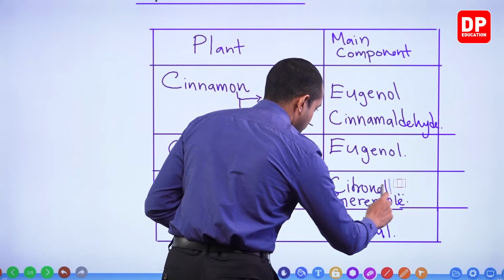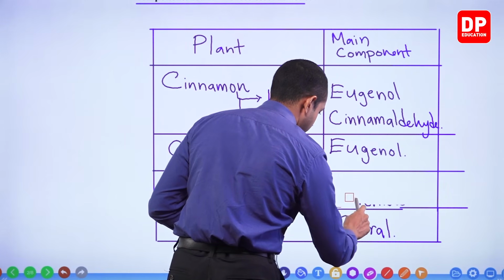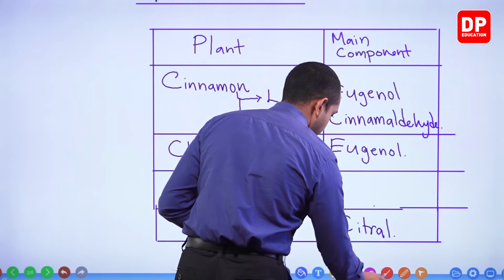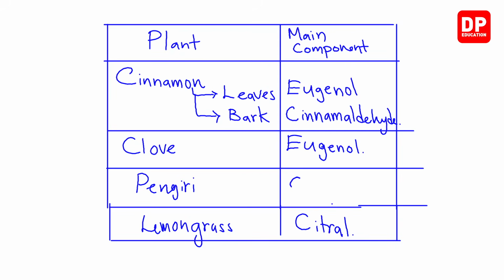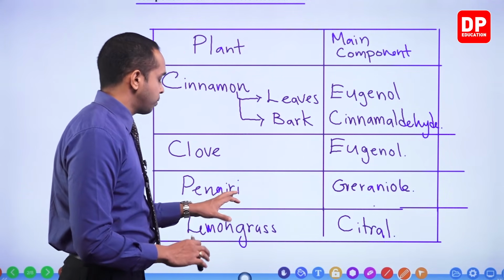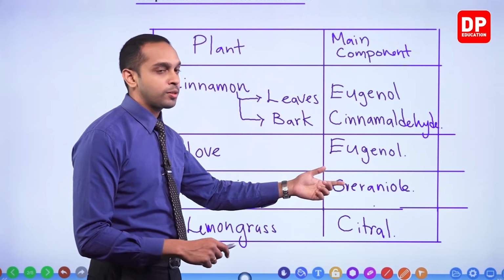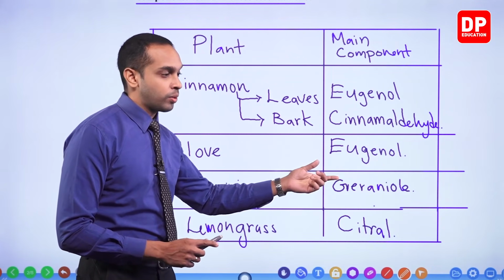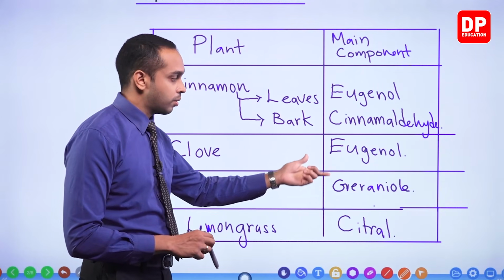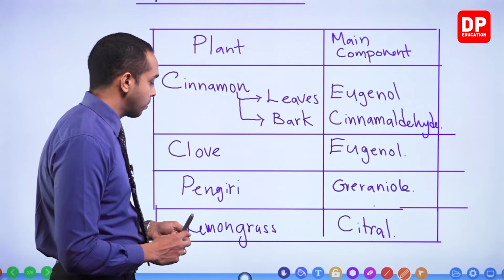The geraniol percentage is slightly higher. So when it comes to citronella oil, geraniol is going to be the major component.